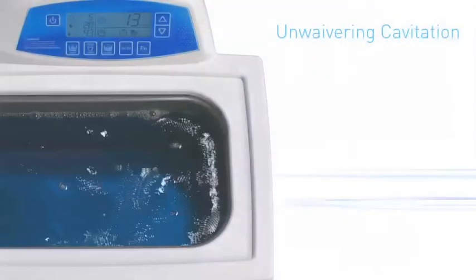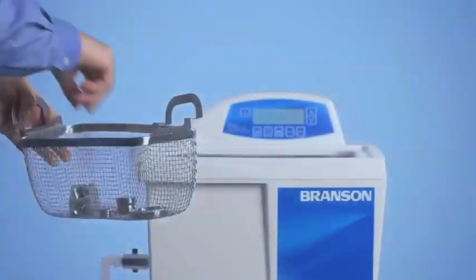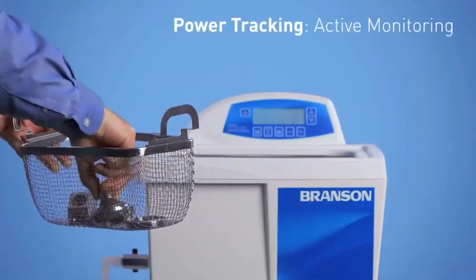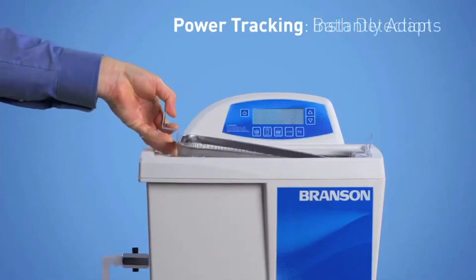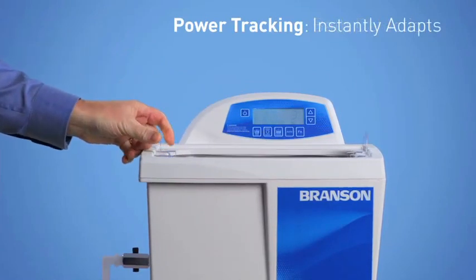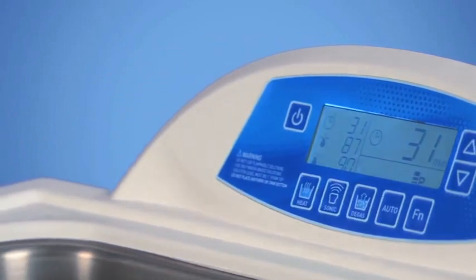With our new and innovative self-adaptive technology, you'll get unwavering cavitation and calibration when load conditions change. The self-adaptive uses ultrasonic power tracking to actively monitor the bath load and detect the adding or removal of items. Once a small change is sensed, the power tracking circuitry technology will bring the operating frequency back to its optimum levels.